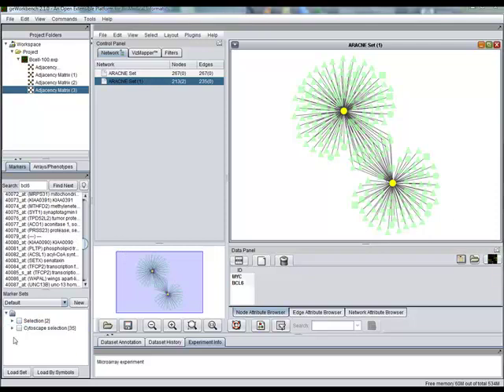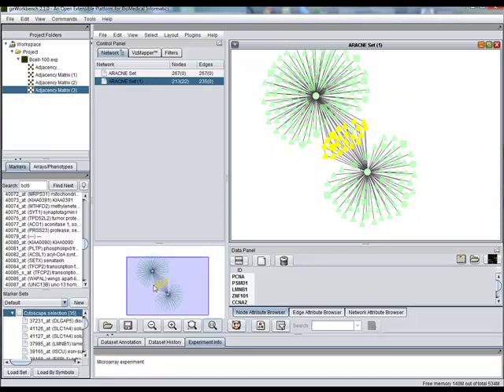The genes or markers that are selected in the selection folder can be projected onto the Cytoscape. For example, for the Cytoscape selection, the genes belonging to the Cytoscape selection: right-click and tag for visualization, say highlight. All the genes that are in the Cytoscape selection are highlighted.